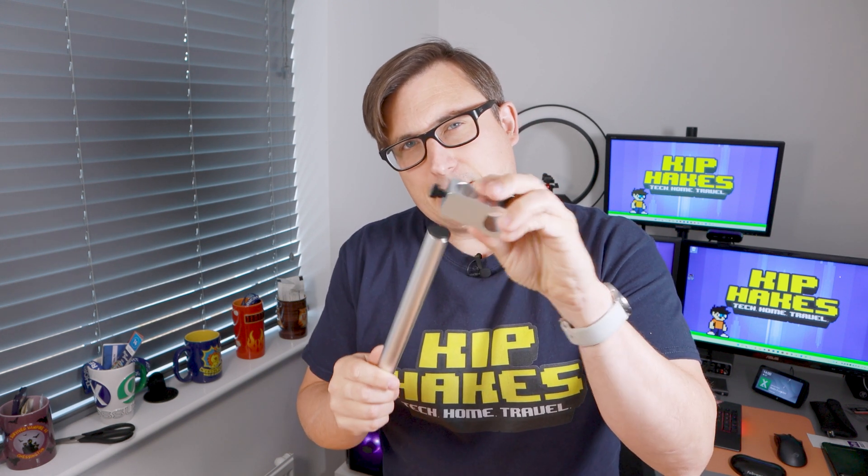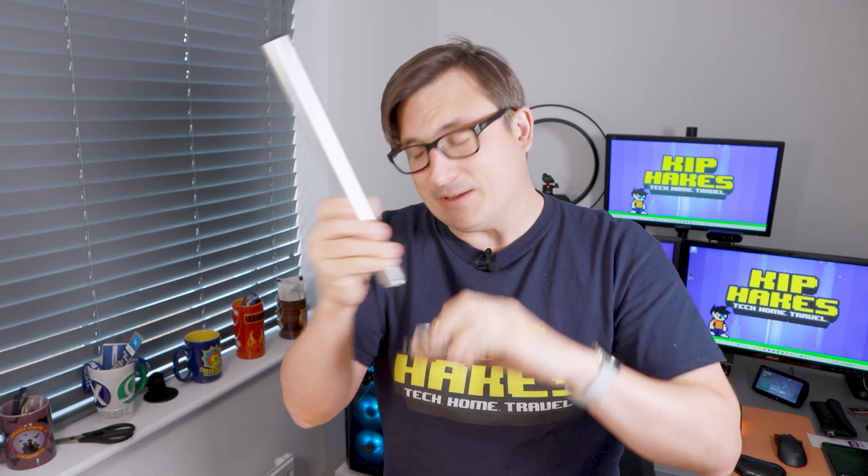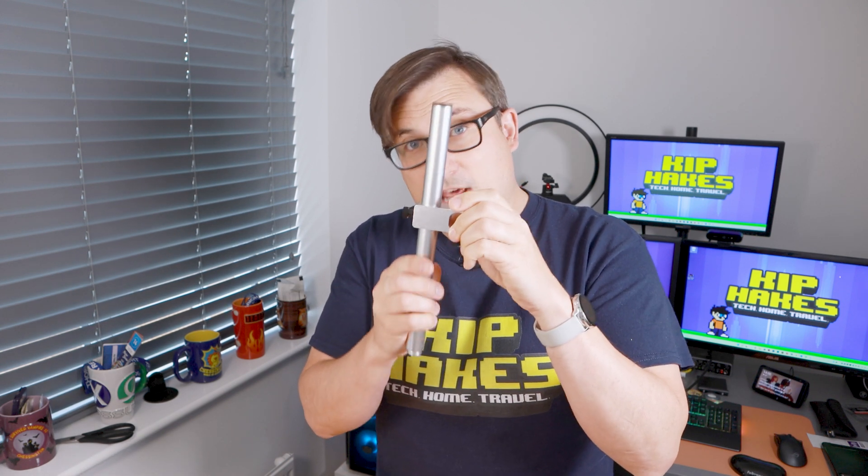This is the arm that the microscope moves up and down on, and this is the bracket that moves it up and down — and it doesn't fit. Because this is a brand new microscope and it's not really out there at the moment, I caught this issue for Andonstar and they very kindly sent me a replacement part from China within a couple of days, and that is what we want.